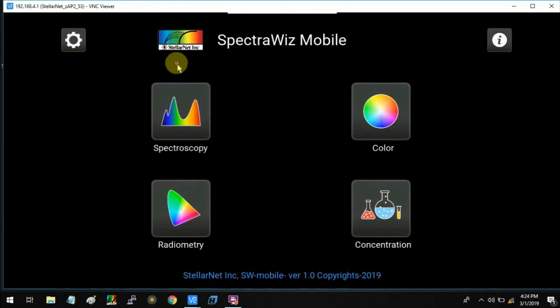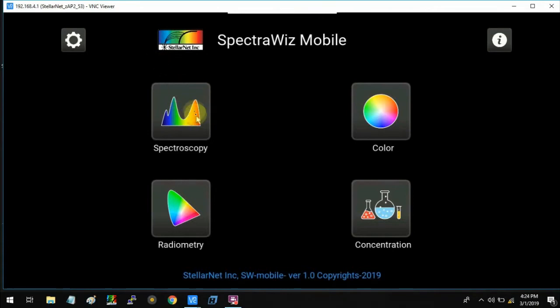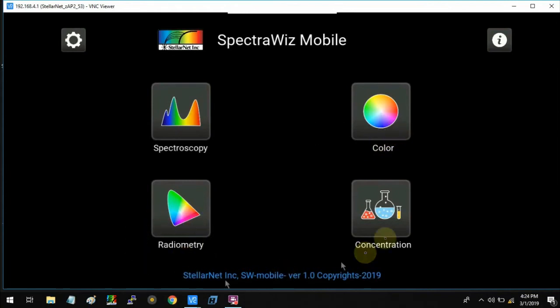As you can see, I have the home page of the SpectraWiz mobile app where there are four icons: Spectroscopy, Color, Radiometry, and Concentration.